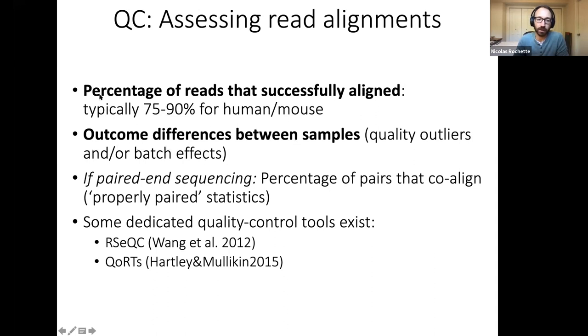There isn't really a way to easily check the quality of read alignments. But typically for a successful experiment, we expect around 80% of reads aligning. There are some quality control tools, but it is a lot of additional work, and the results are often not very clear cut. So unless there is a big issue with the data set, it's not necessarily useful to really dig into quality checks at the alignment level.